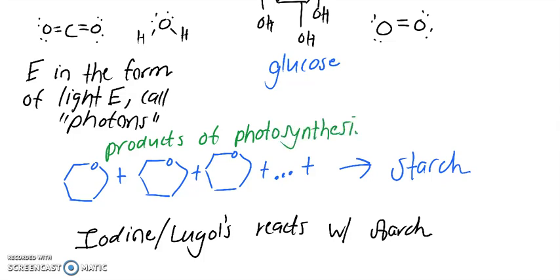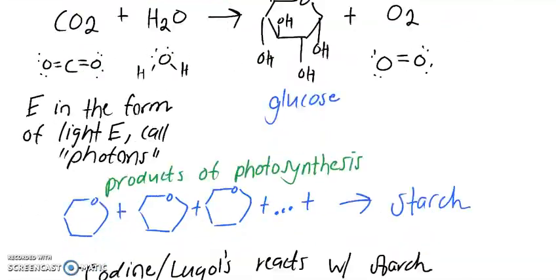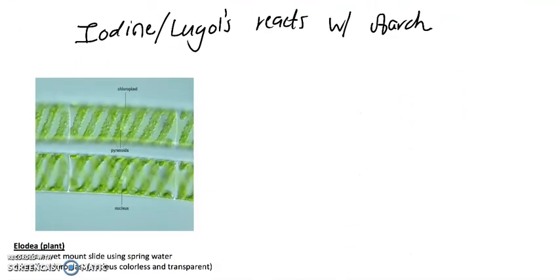Okay, and lastly, these do have nuclei, but they might be hard to find. But they do have nuclei. It might be transparent, but it's there. So, nucleus. Okay, so there is some spirogyra.